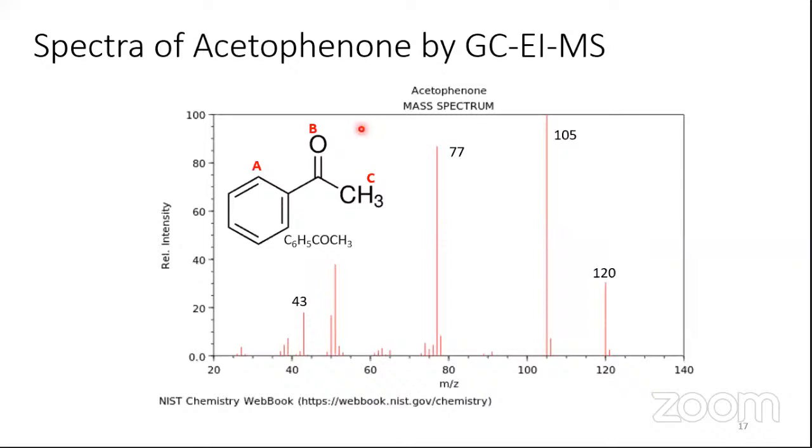So that is how the spectrum helps you find out what all these peaks are, which are called m/z peaks. This is the molecular weight. This is called the base peak. We consider the base peak as 100%, and with respect to that all other peak intensities are calculated. This is called the relative abundance spectrum, the relative intensity with respect to the base peak as 100.